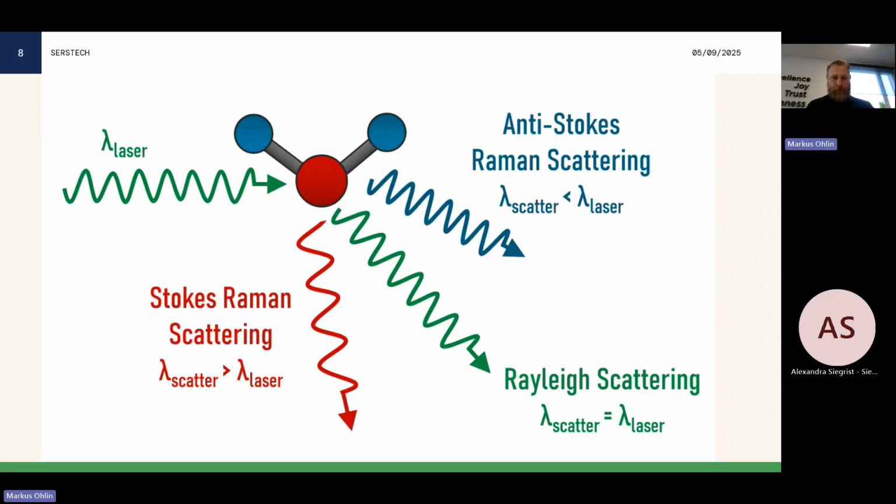So Raman spectroscopy utilizes the shift. When light hits a molecule, almost all light is reflected or scattered in the same wavelength, what we refer to as Rayleigh scattering. And Rayleigh scattering consists most of the scattered light. So almost all light comes back exactly the same wavelength. And that is not something we could use. That is something we have to filter and sort of remove as much as possible, because that's not interesting for what we're trying to achieve.